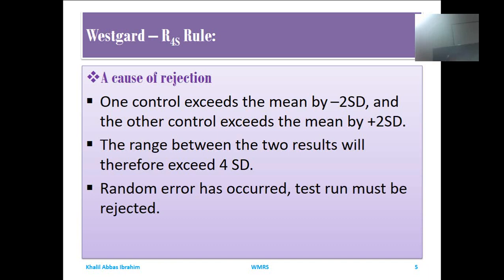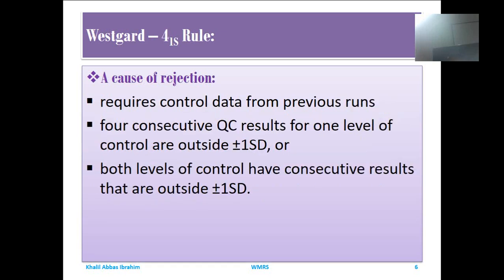It should be rejected, the situation investigated, errors pointed out, and the causes of the errors and the sources identified. Then corrective actions are adopted and implemented, and after that re-examination or resumption of the examination takes place, and the results obtained should be evaluated for being free from defects and free from weaknesses.